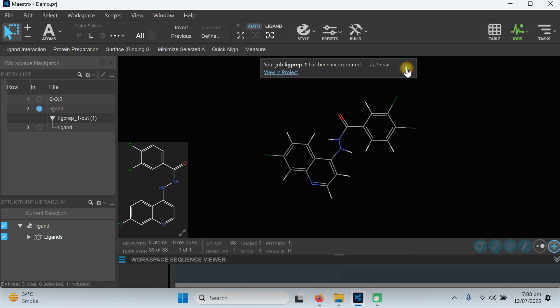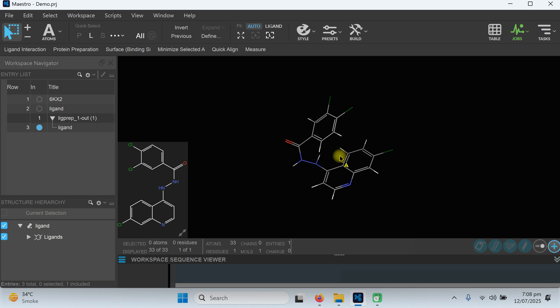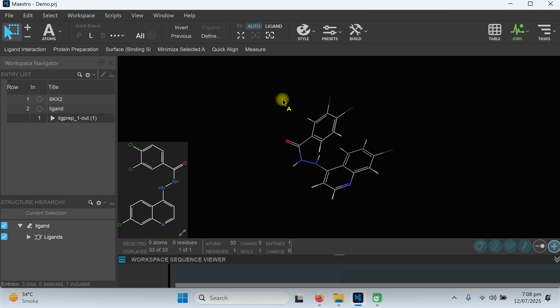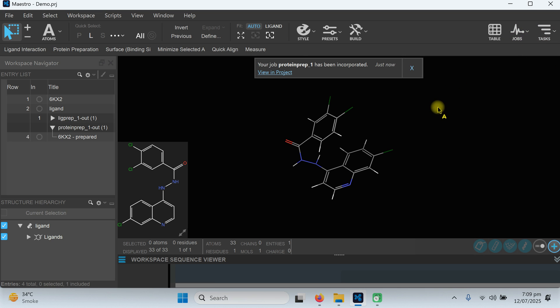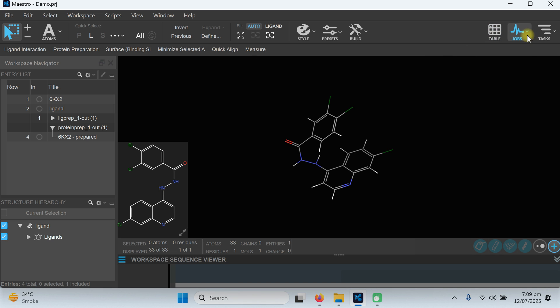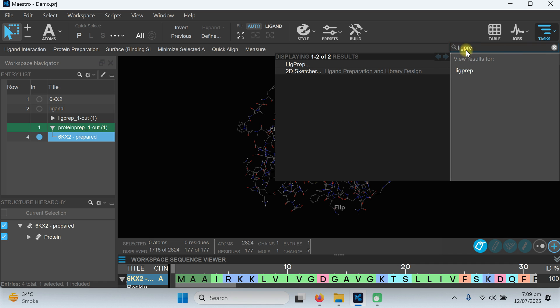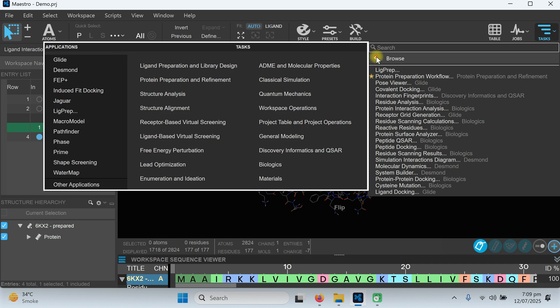The ligand preparation has been completed — this is our prepared ligand. The protein preparation job was still running but is now also completed and incorporated. This is our prepared protein. Both our ligand and protein are prepared. The next step is covalent docking.